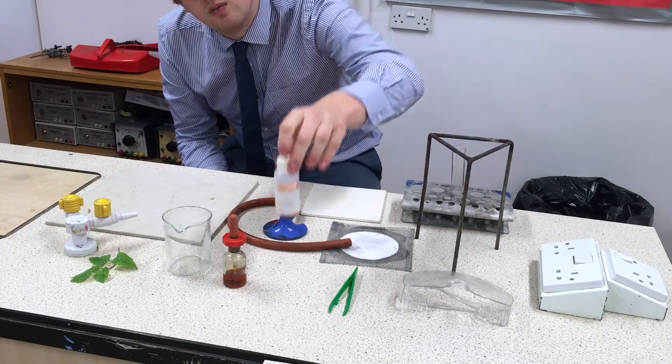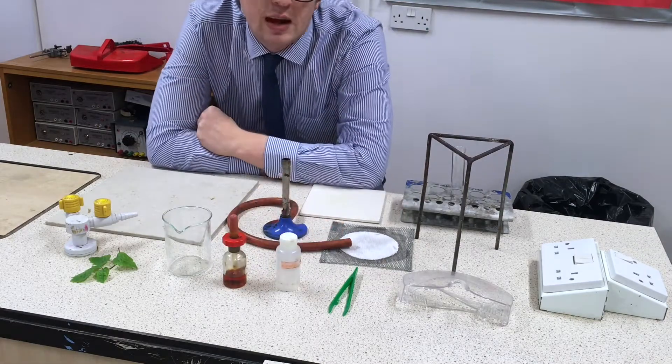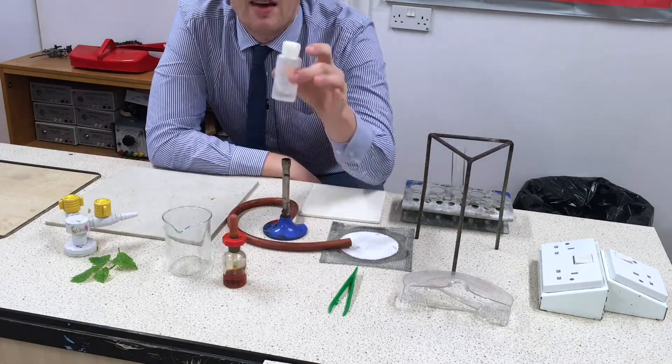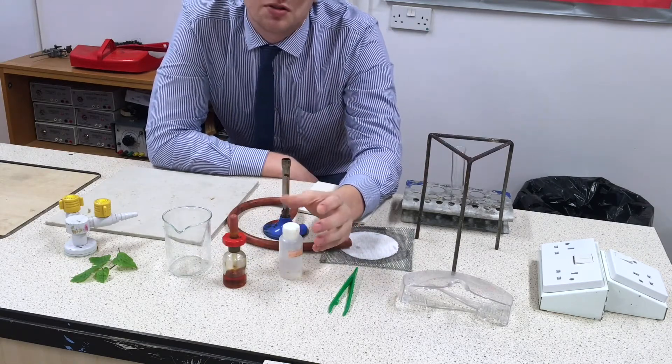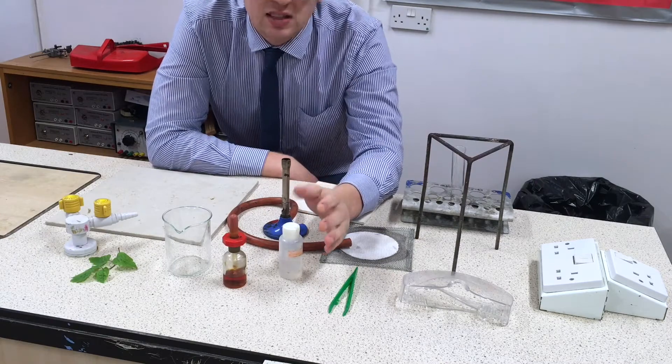The chemicals we'll need are ethanol. Now, ethanol is highly flammable. This means that whenever we're getting out the ethanol, we need it to be away from a naked flame and the Bunsen burner off. Indeed, we'll actually turn off the gas to be extra safe.